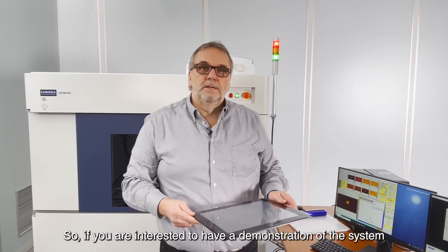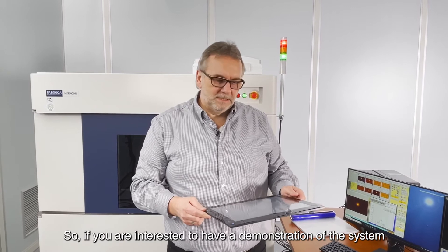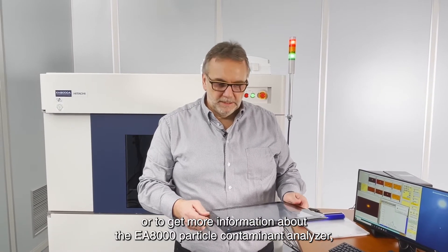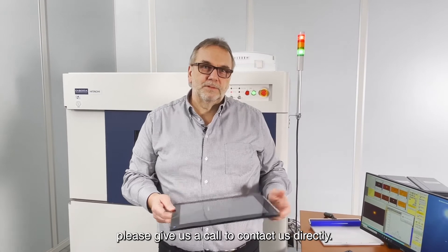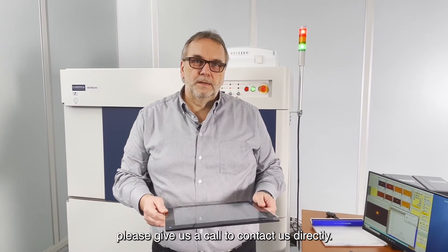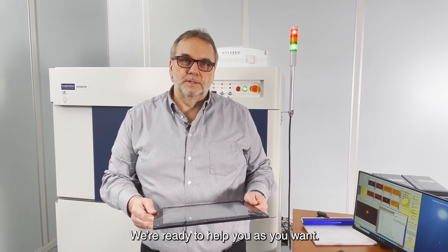So if you are interested to have a demonstration of the system and get more information about the EA8000 particle contaminant analyzer, please give us a call and contact us directly. We are ready to help you as you want. Thank you.